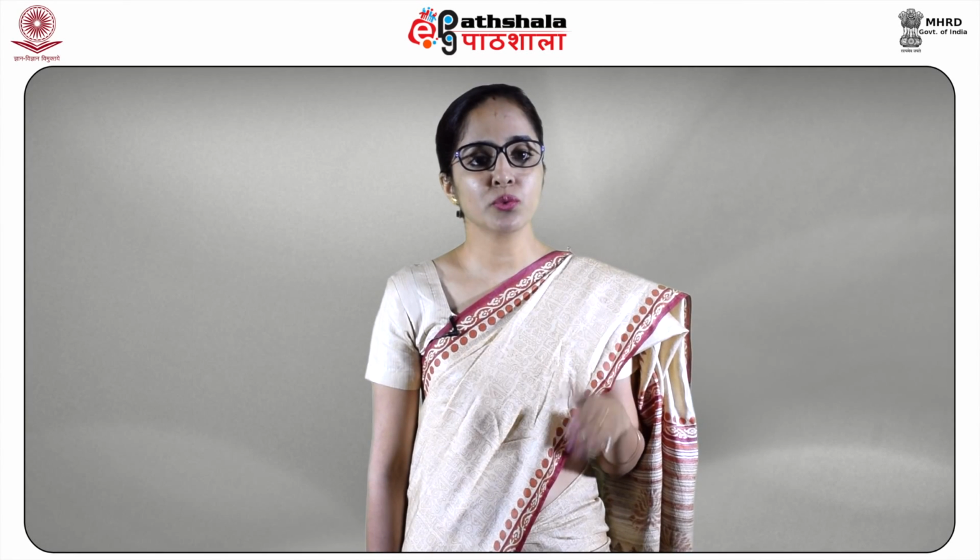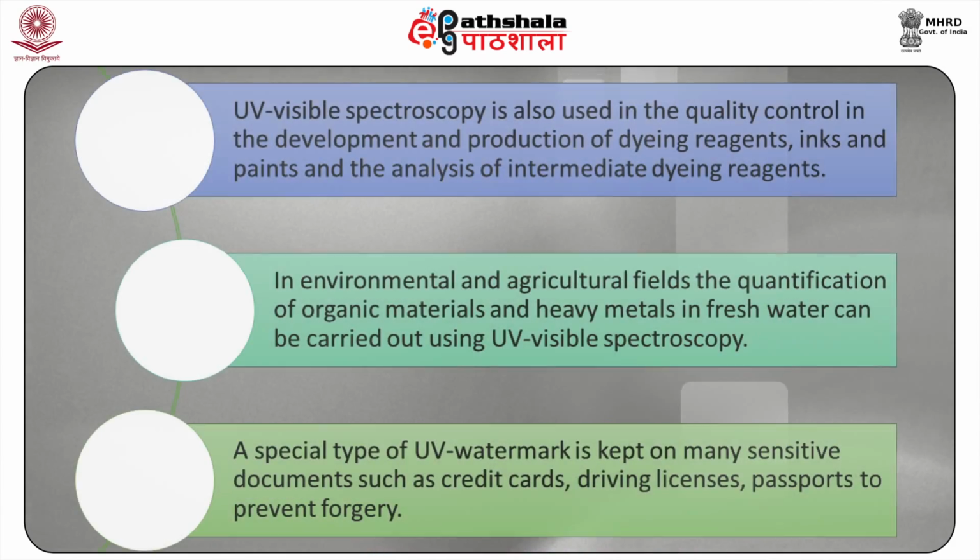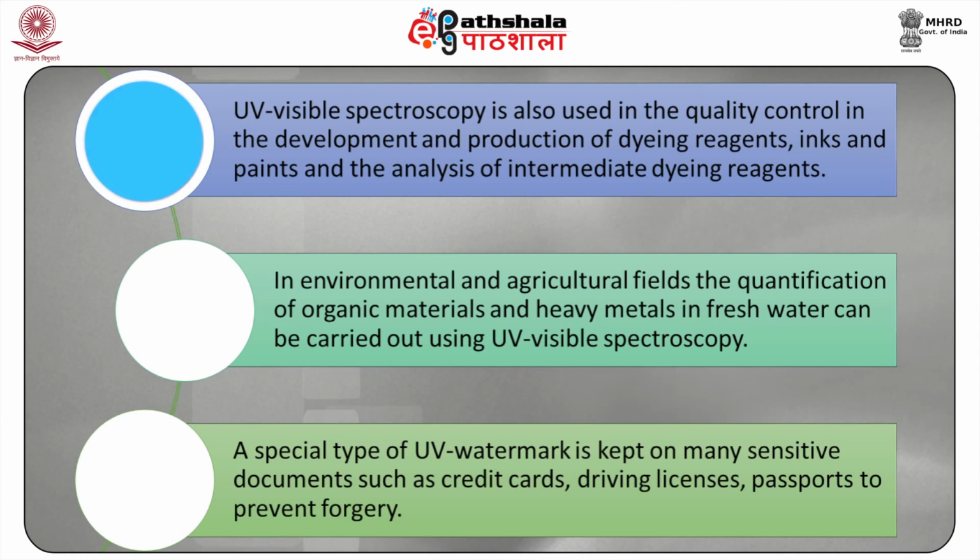Now, coming to the other uses, summarizing the general uses of UV visible spectroscopy. UV visible spectroscopy is also used in quality control in the development and production of dyeing reagents, inks and paints, and the analysis of intermediate dyeing reagents.